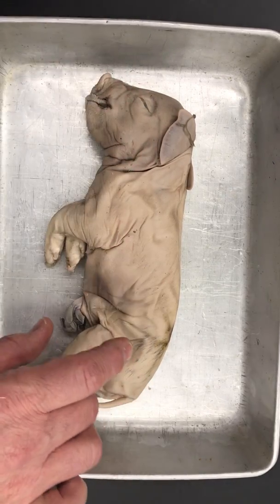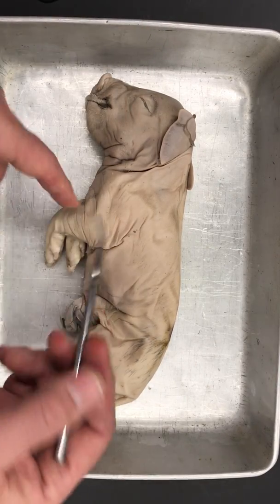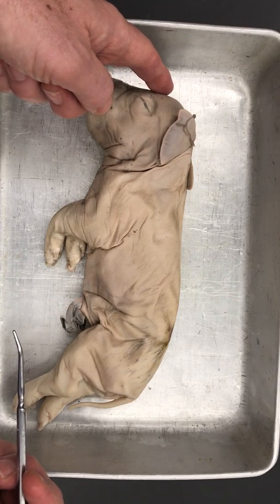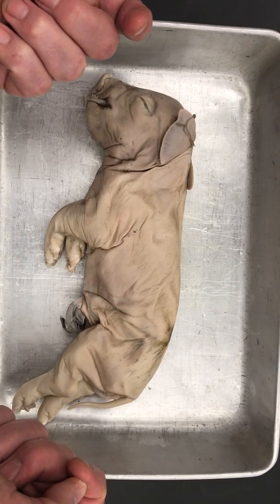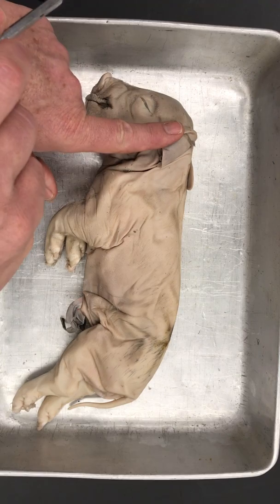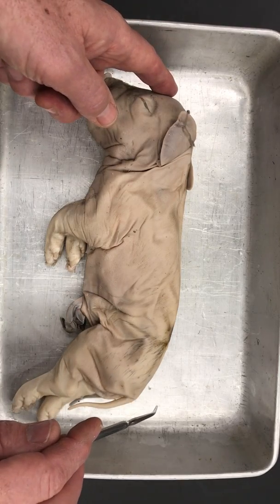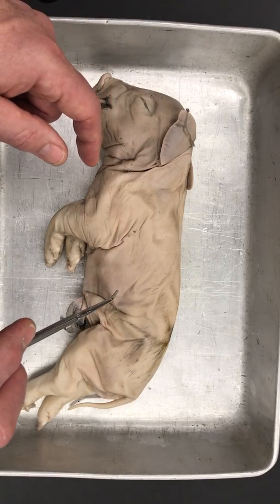So if we take a quick tour of the external anatomy, first of all, let's talk about anatomical positions. So the superior end of the pig and the inferior end of the pig are a little bit different than you and I, right? More likely we call this cranial. Why cranial? Because we've got the cranium, we've got the skull right here, and the caudal end, and caudal means tail. Right, so you've got superior and inferior, cranial and caudal, and those are pretty much the same.